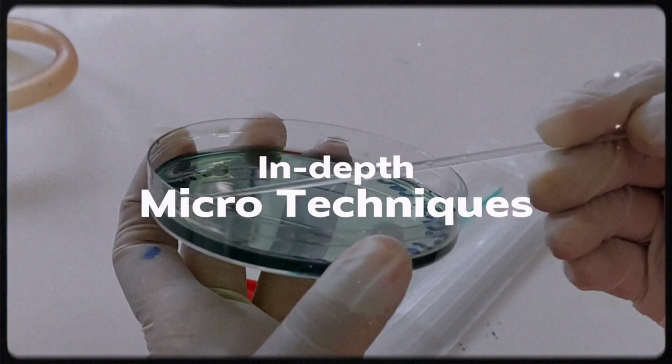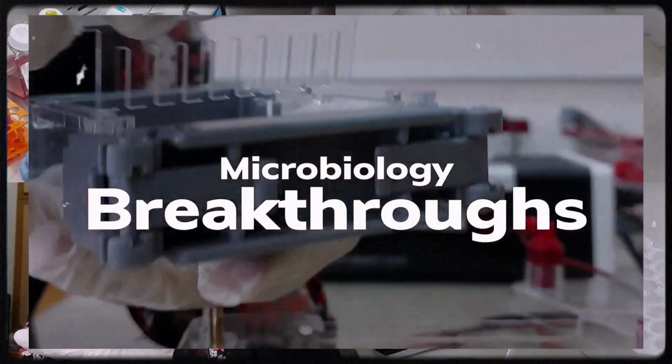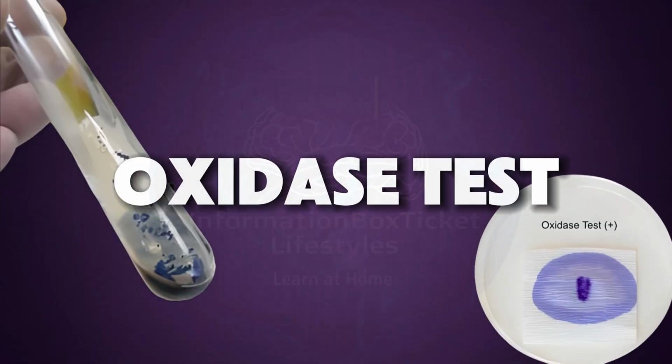Let's explore in-depth micro techniques and uncover groundbreaking insight together on this educational journey into the fascinating realms of microbes. Oxidase test in microbiology. Everything you need to know.